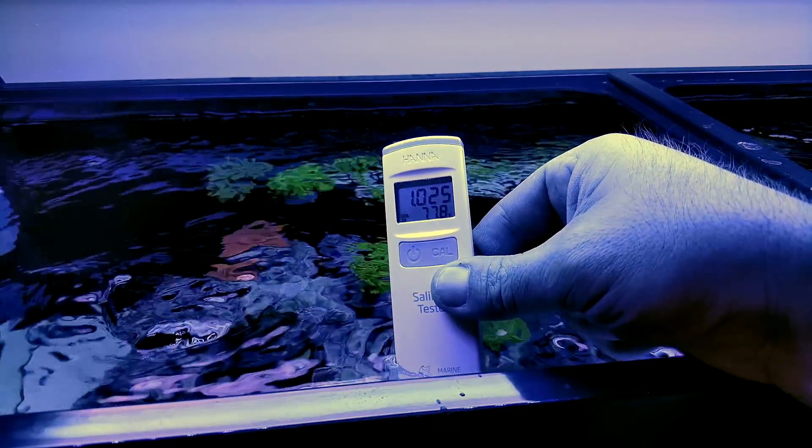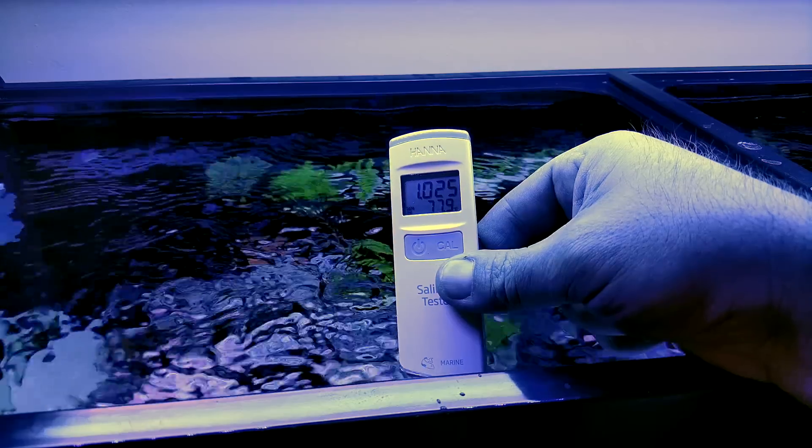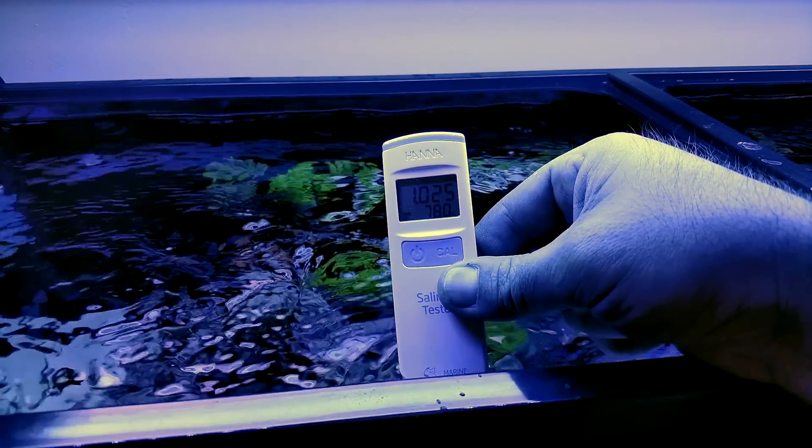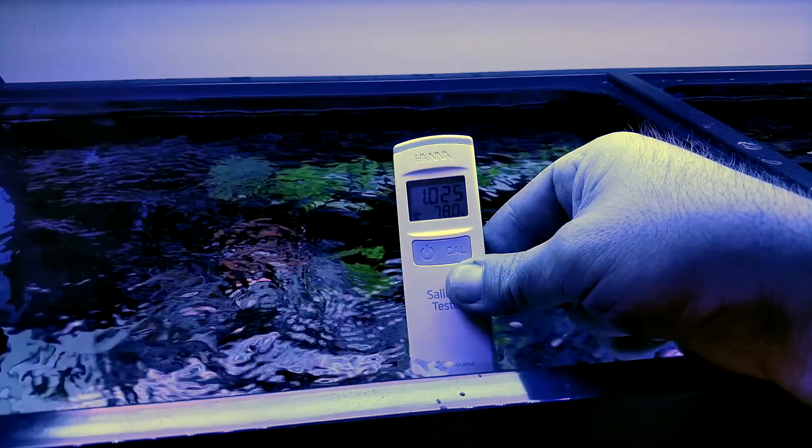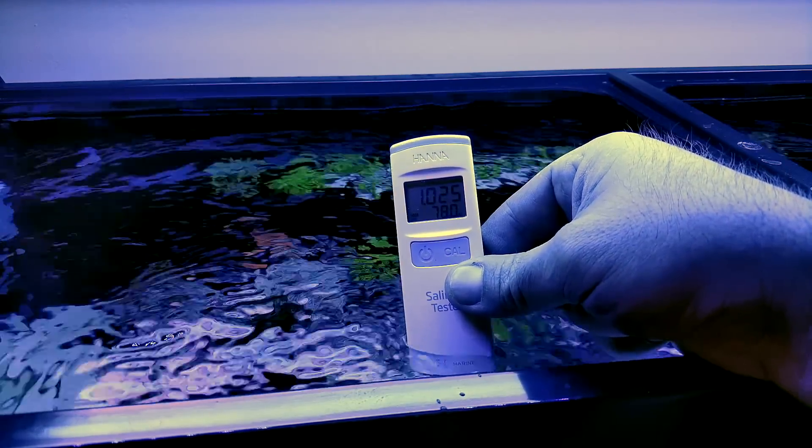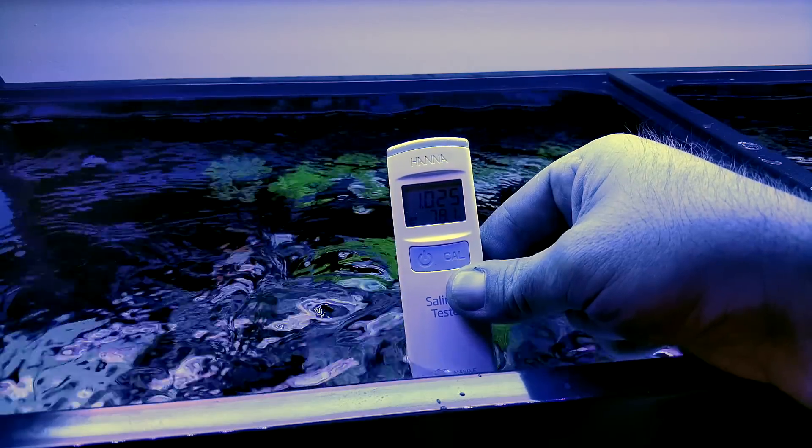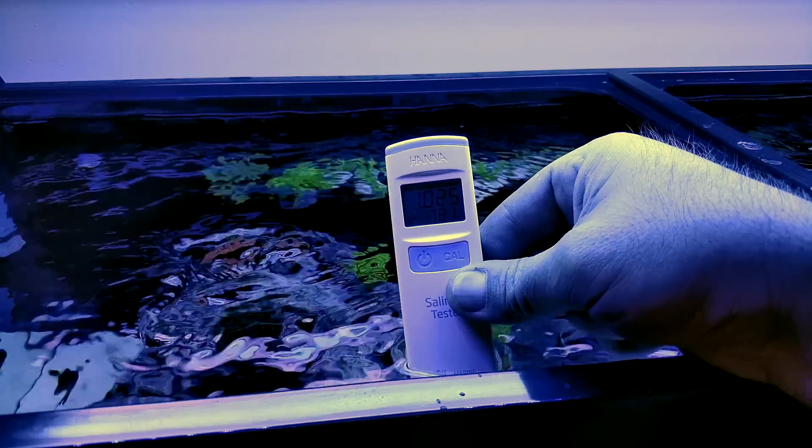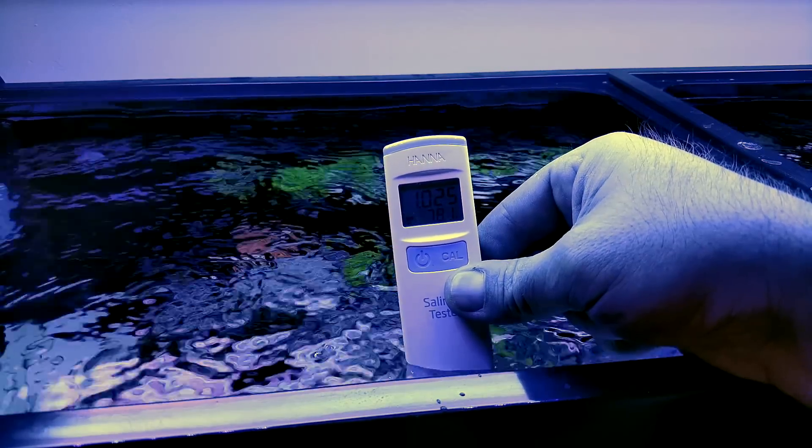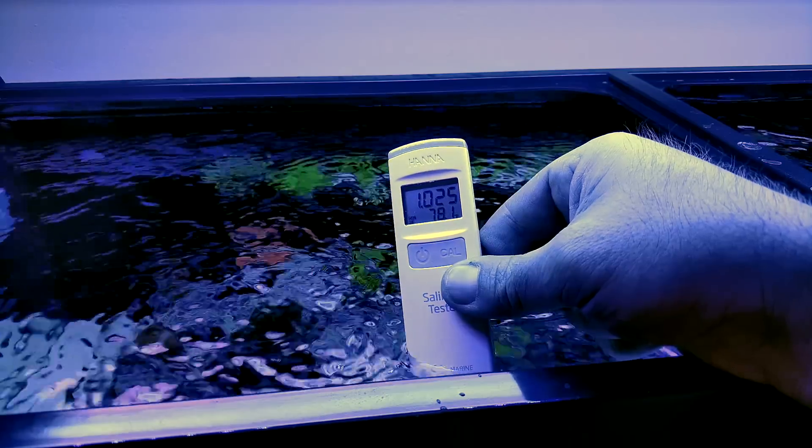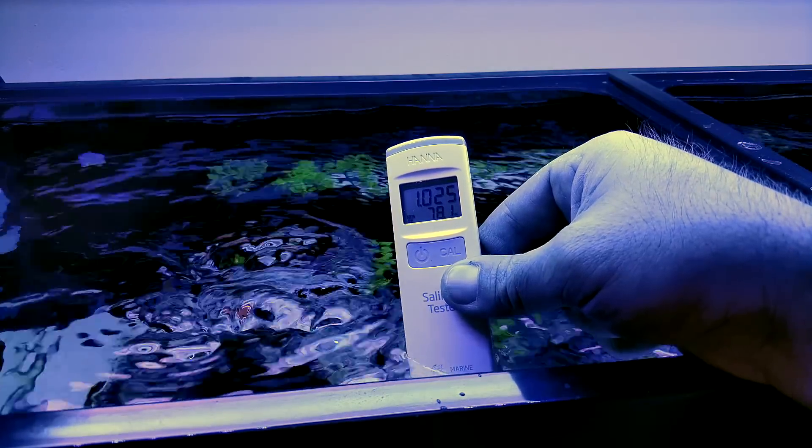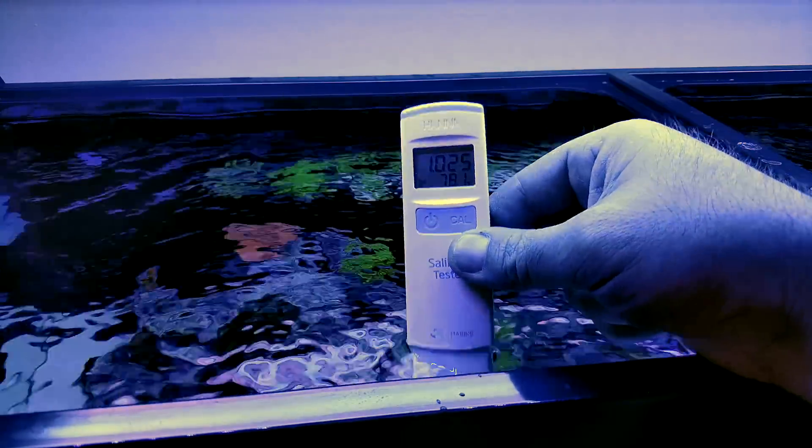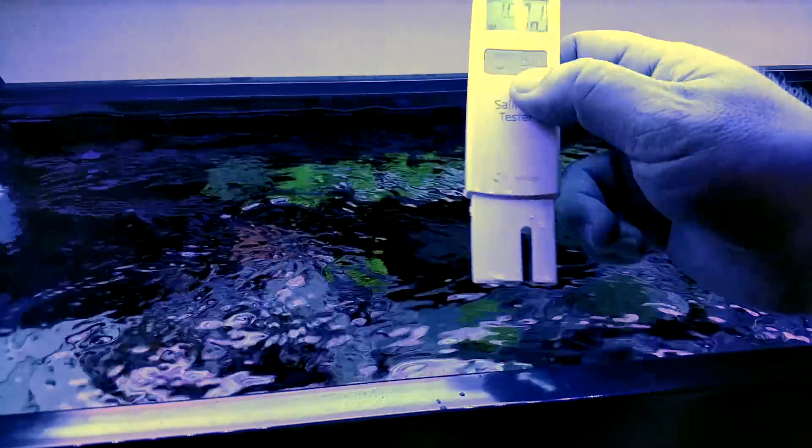So I'm going to try and hold it so you guys can see it. Salinity is 1.025 and you can kind of see right here. There's a little indicator that it's running its numbers and it's a little hourglass. Once the hourglass stops blinking, that pretty much tells you we've determined the salinity and we've determined the temperature. So I'm at 78 degrees and 1.025. So it's pretty good. I'm very happy with it. Love it. That's how simple it is.